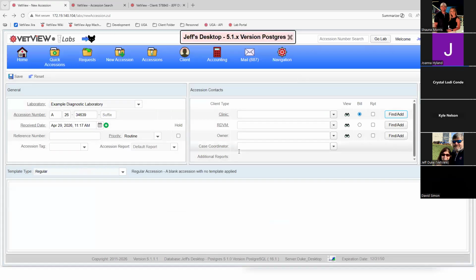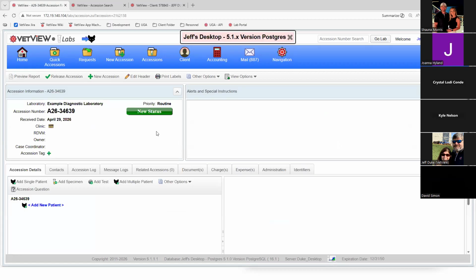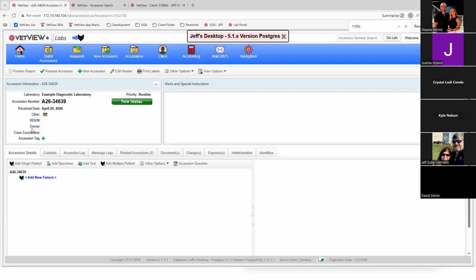Now, also, if you want to, you can skip past this and come back to it later. You don't even have to fill it all in. When we say something's required, we're talking about required before the case finishes. So I can actually put the case in there, start it, get results in it even. All it's going to prevent is that if I go to try to finalize this session at the end of the process, if, say, the bill party has not been filled in, it's not going to let me finalize the case. So those requirements only really kick in at the very end of the process, because we don't want to delay other steps that may be going on.